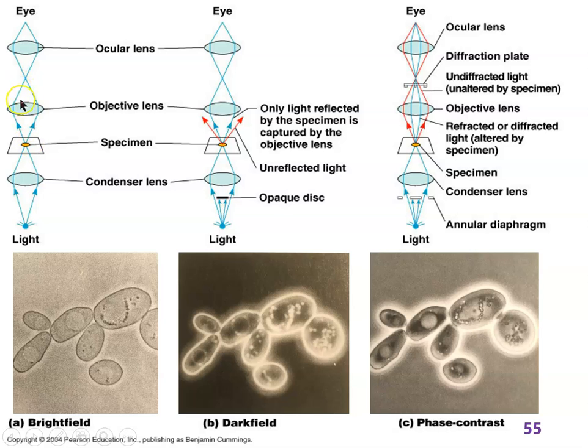The simplest kind, bright field, doesn't add any contrast, and the yeast cells are hard to see. You can't see much detail because they are just bags of salt water, and salt water is invisible, right? Dark field microscopy gives us this dark background, and the cells bend the light, so you see them glowing.